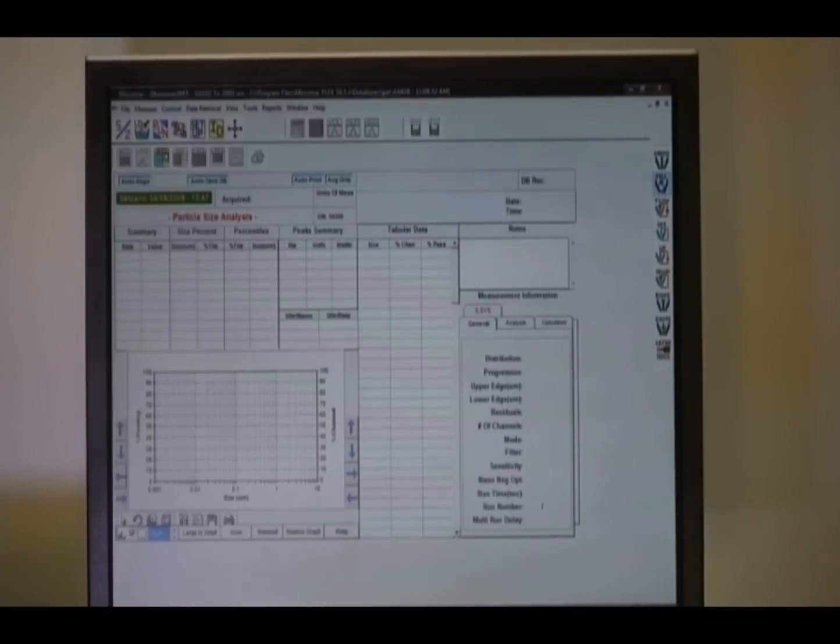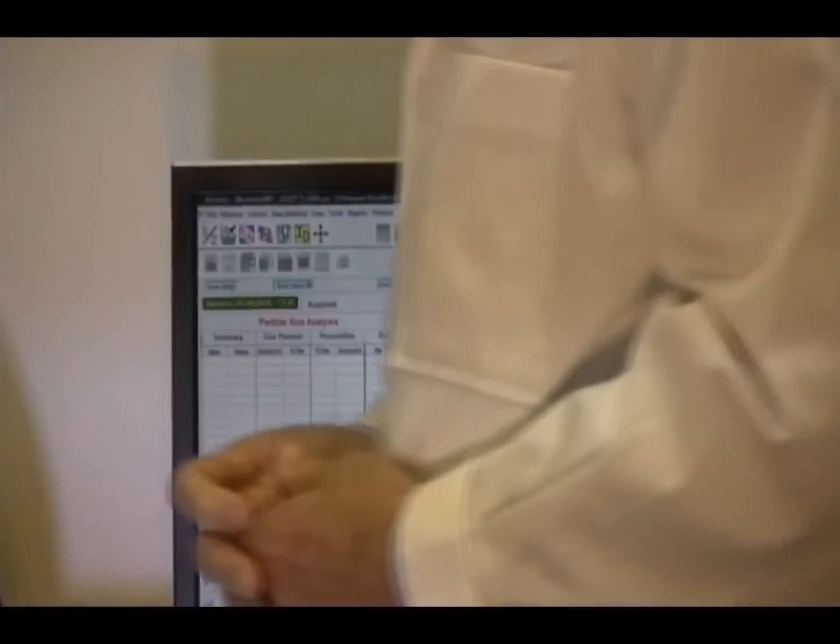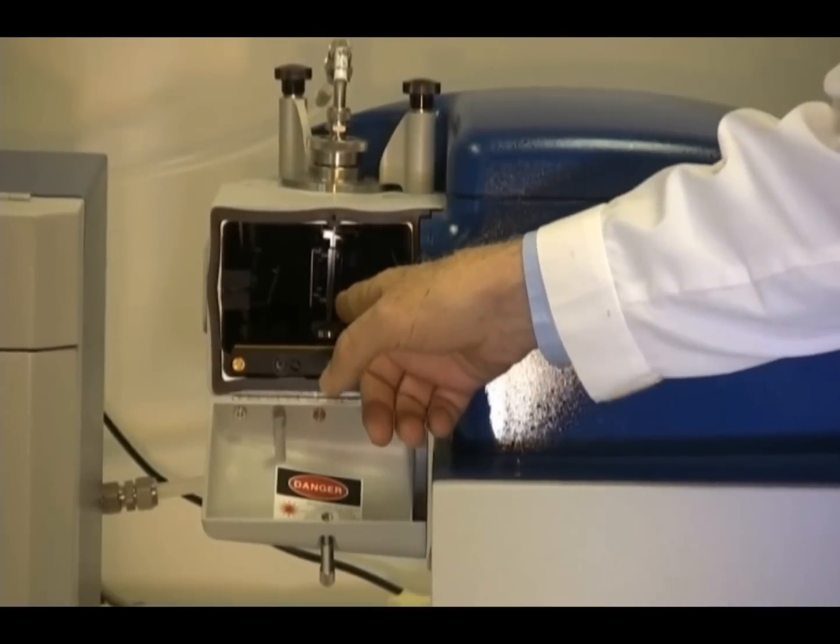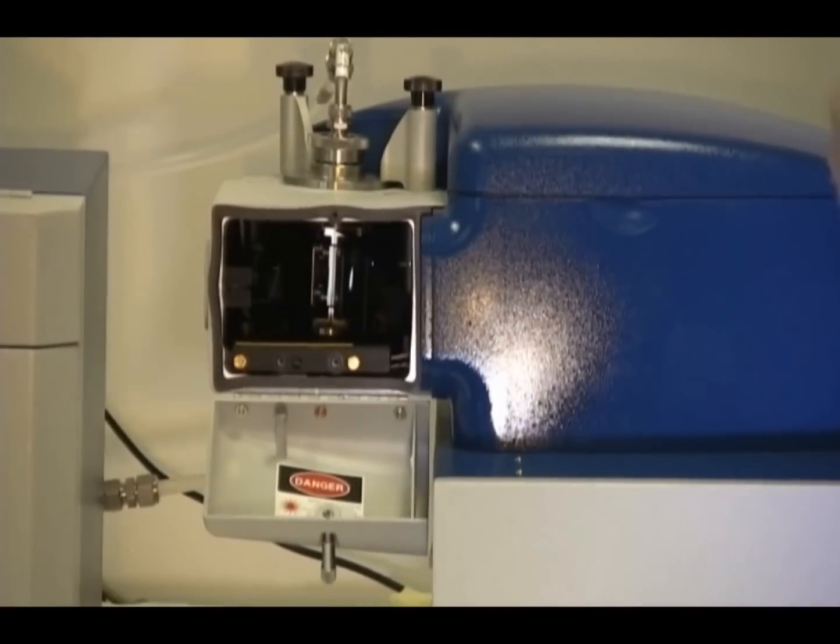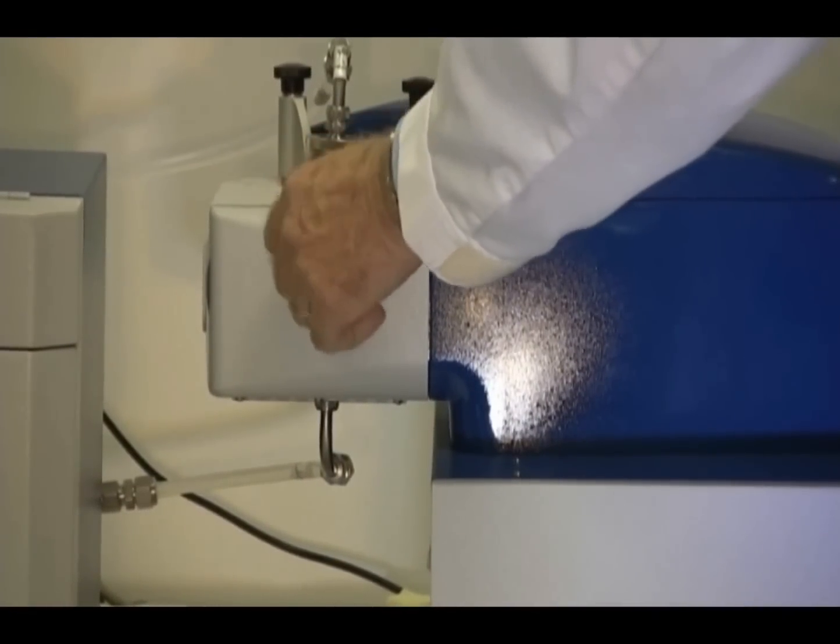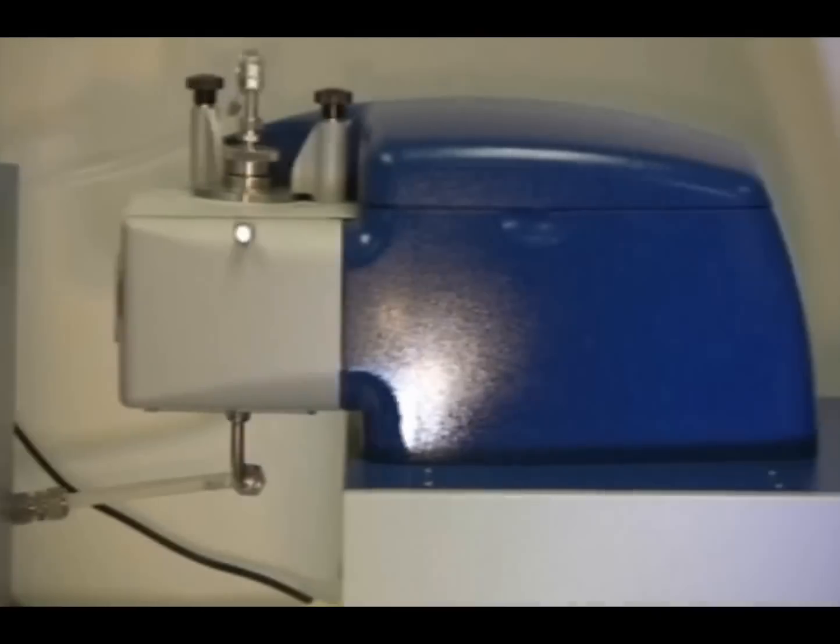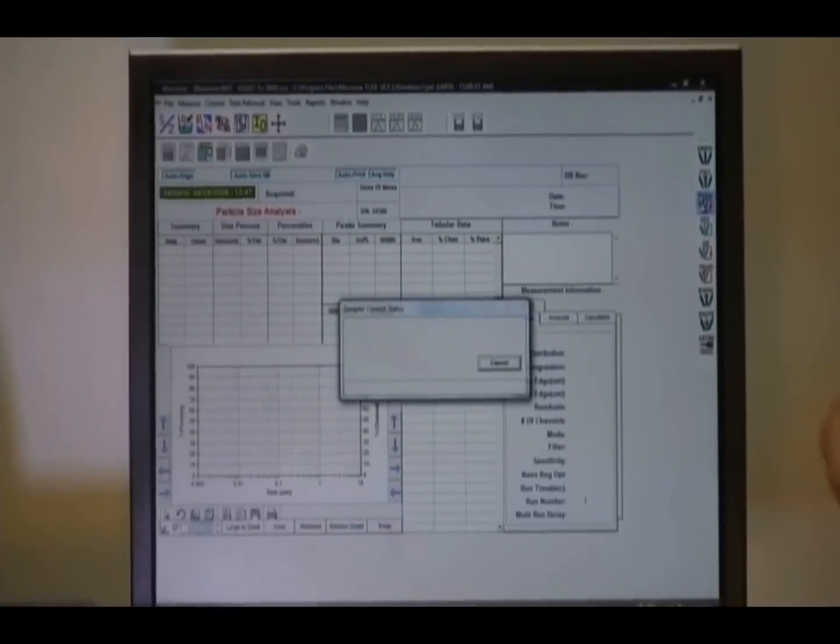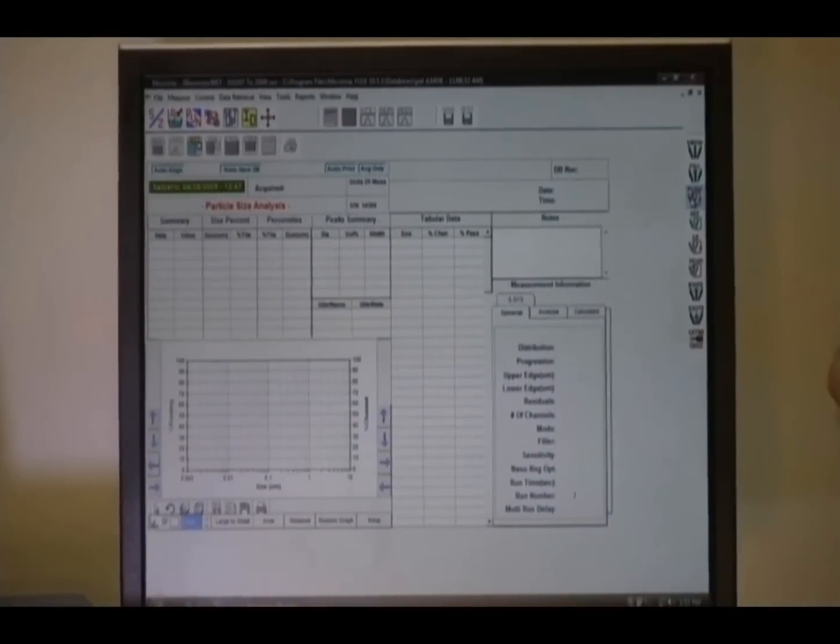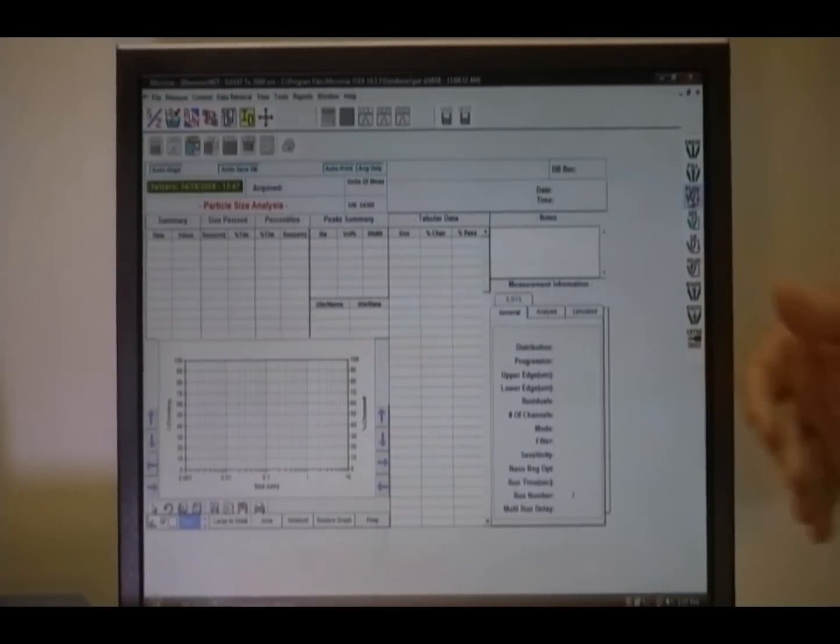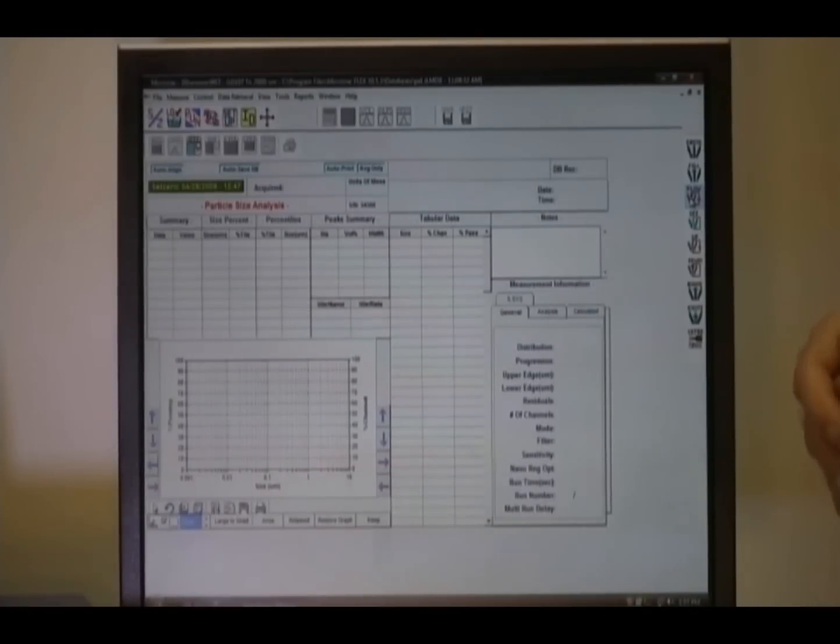At this point, it's valuable to check the system inside the sample compartment for any leaks. So, it's just necessary to look for any fluid that may be surrounding the sample cell holder. Since the system is now filled and there is no evidence of any leaks, I can close the sample cell compartment door, turn the screw clockwise until the screw is snug. Then, I return to the computer and start the flow of the instrument. The flow is set on 40%. Normal flow rates for most materials is between 40% and 55%. The flow has now been started and I'll now check the system for alignment and set zero.